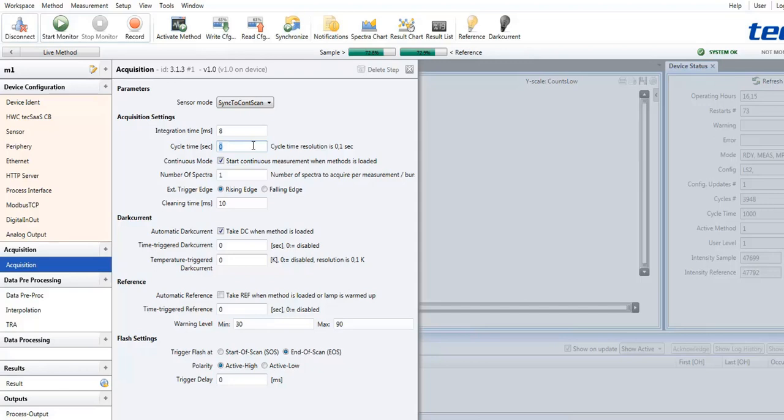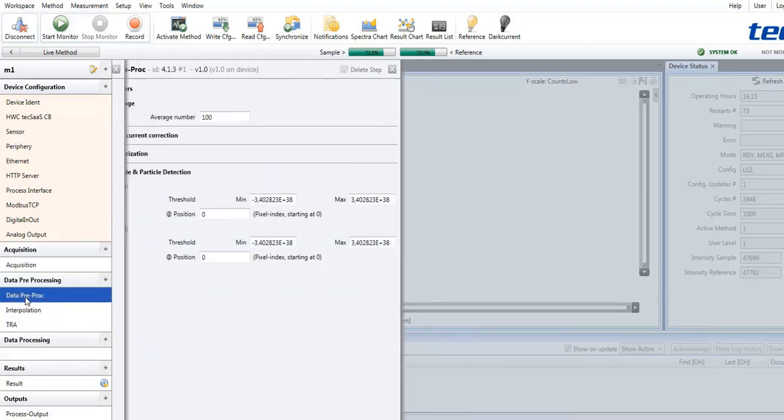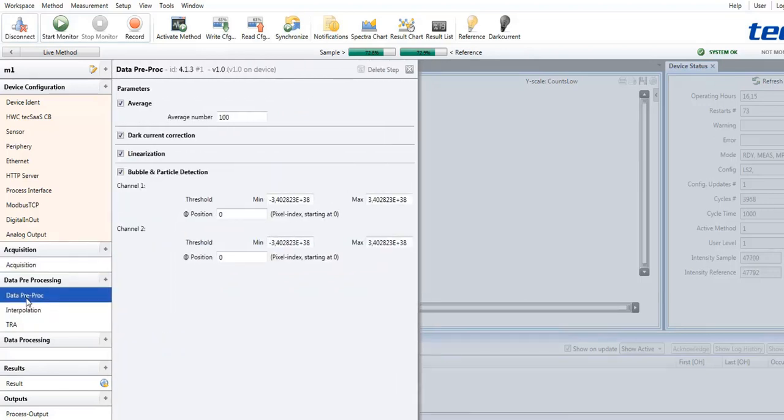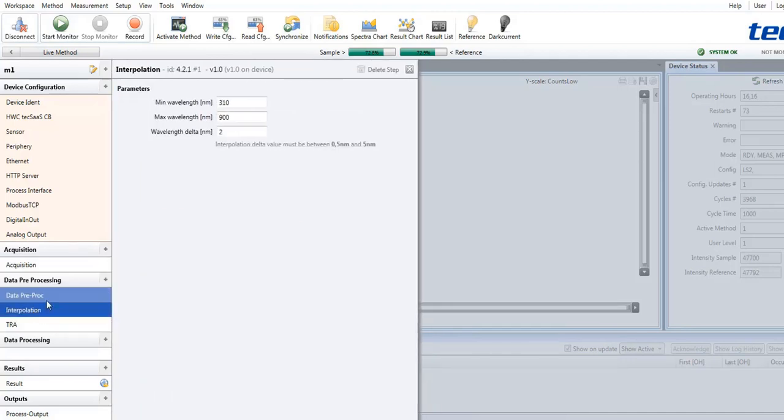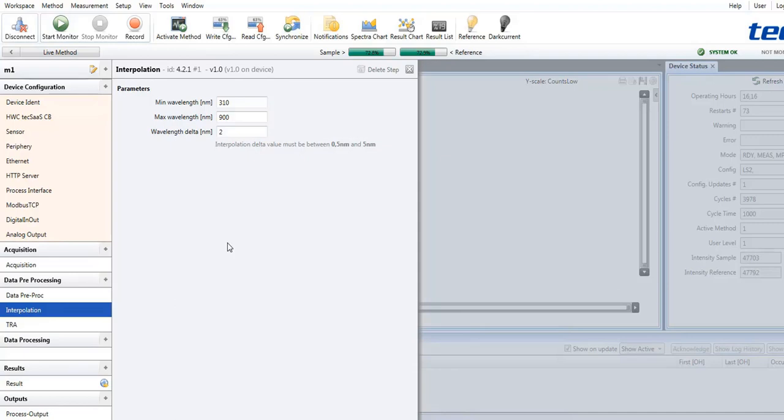Then, data pre-processing steps may be defined. For example, averaging a number of single measurements, or dark current correction, linearization, or also interpolation parameters, specifying the wavelength range and the step width for the spectra to be processed.